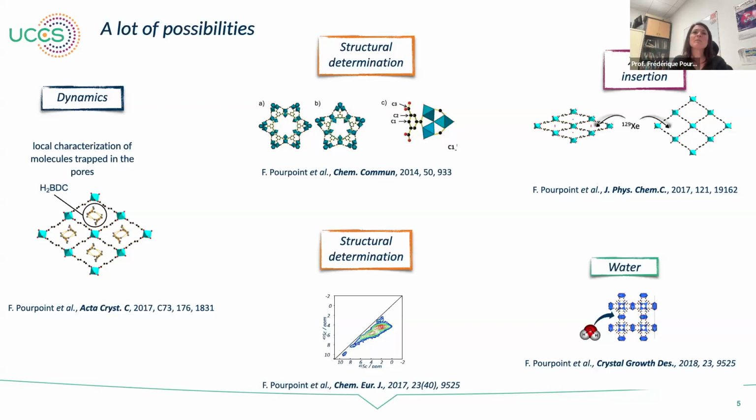Using some fun nucleus like scandium-45 NMR, we were able to do structural determination as well. And we also observed some influence of the water in the system through the NMR.